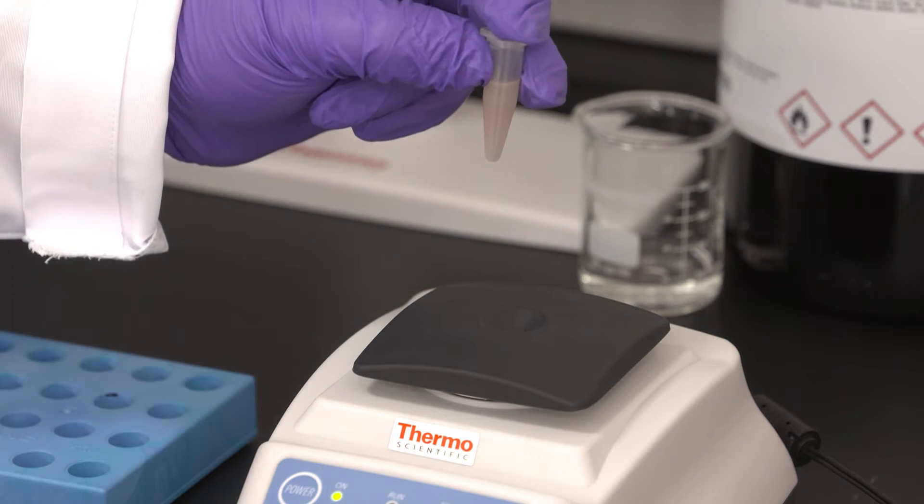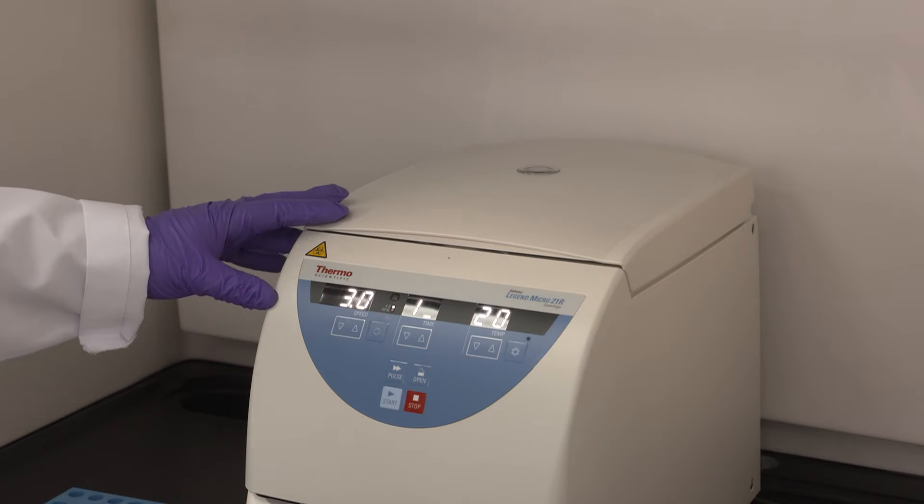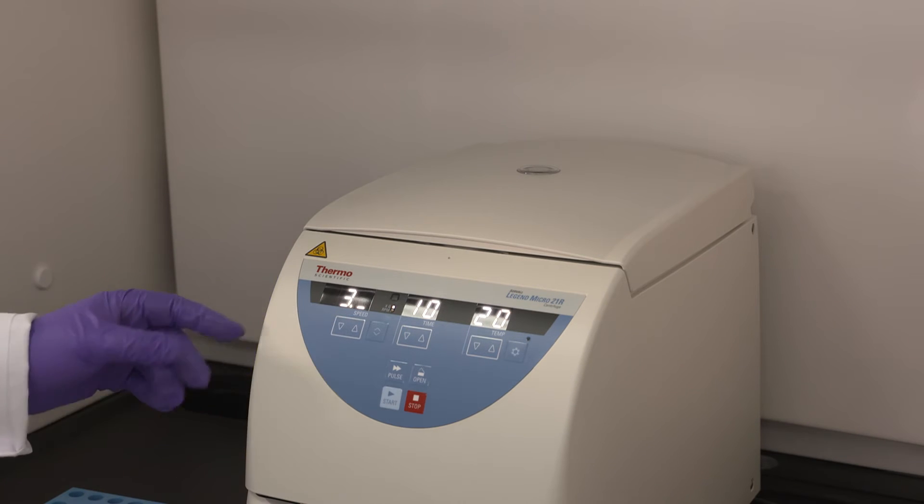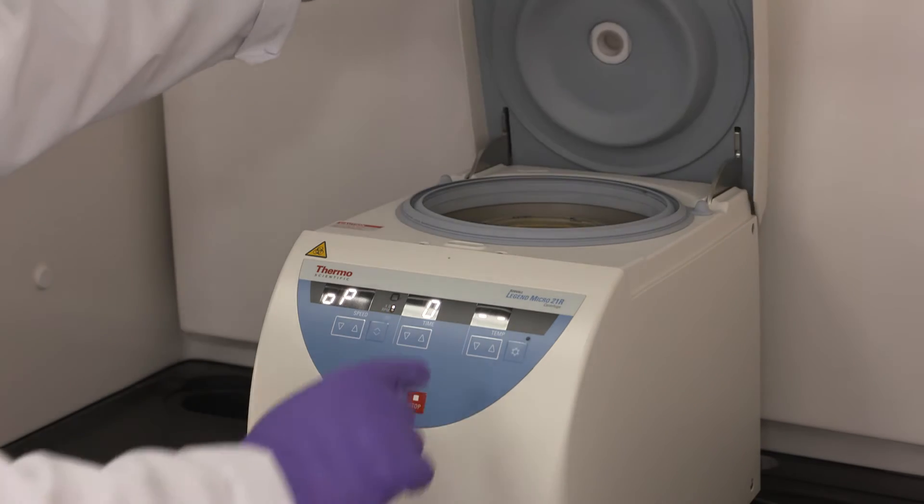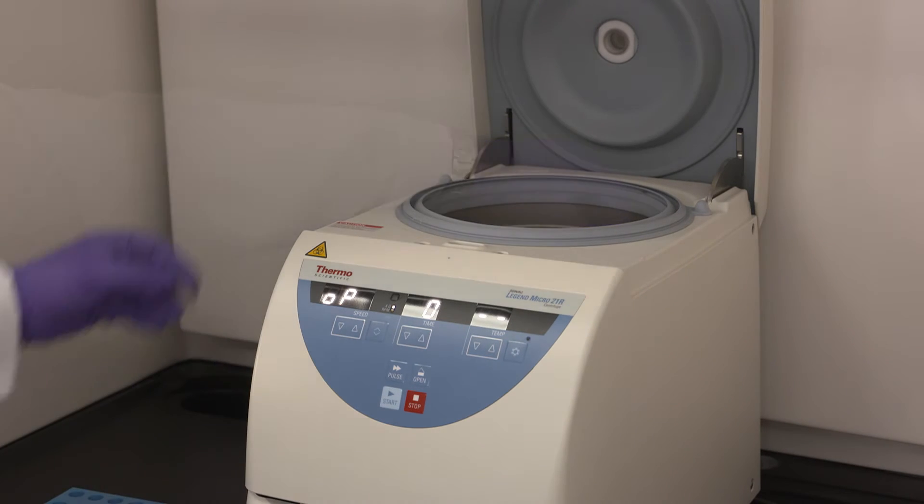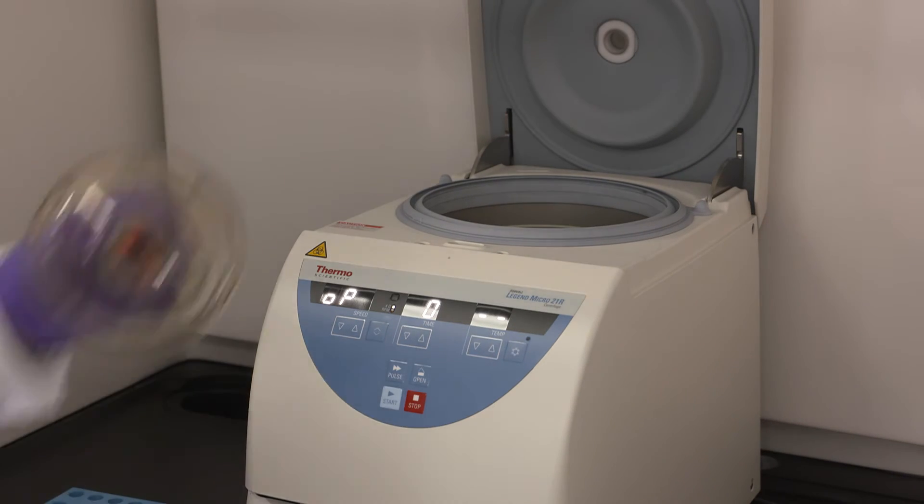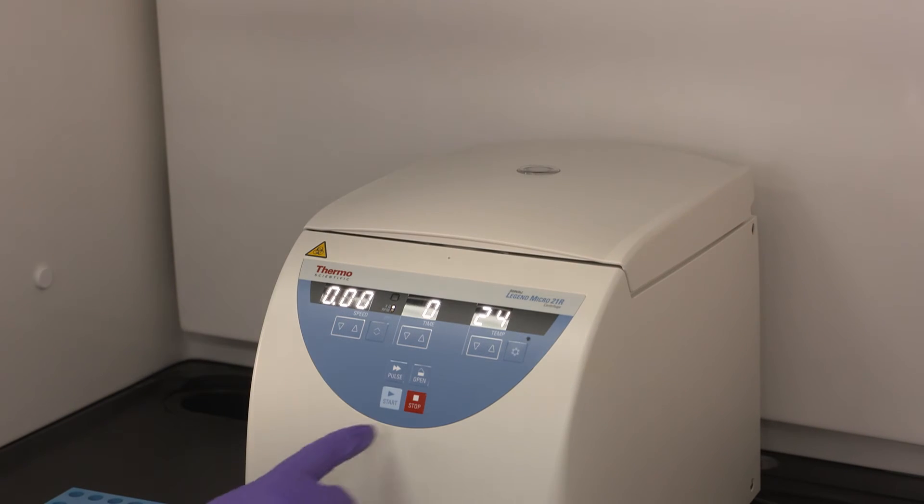When the sample is completely homogenous, we will centrifuge the sample at 3000 g. Following the vortexing, we will centrifuge the sample at 3000 g for 10 minutes at room temperature. The protein will be concentrated mainly at the bottom and the side of the tube, and we will be able to remove the mixture of acetone and water.